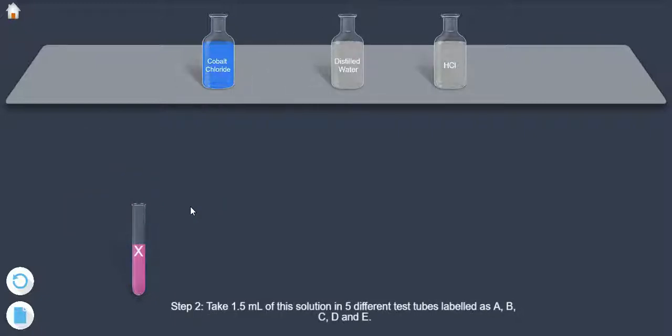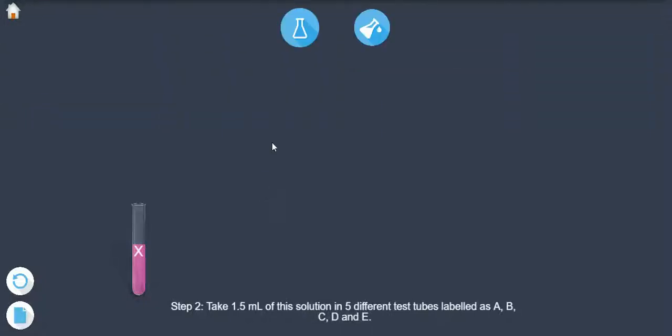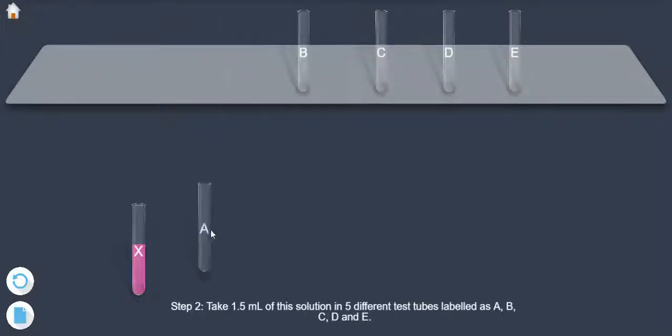Take 1.5 ml of this solution in 5 different test tubes labeled as A, B, C, D and E.